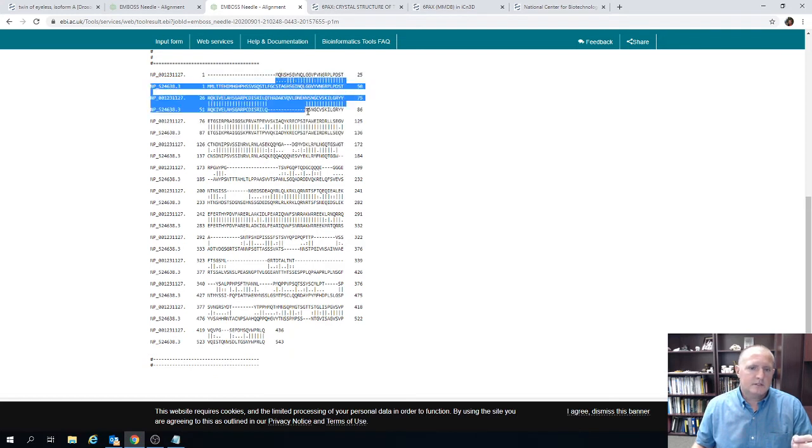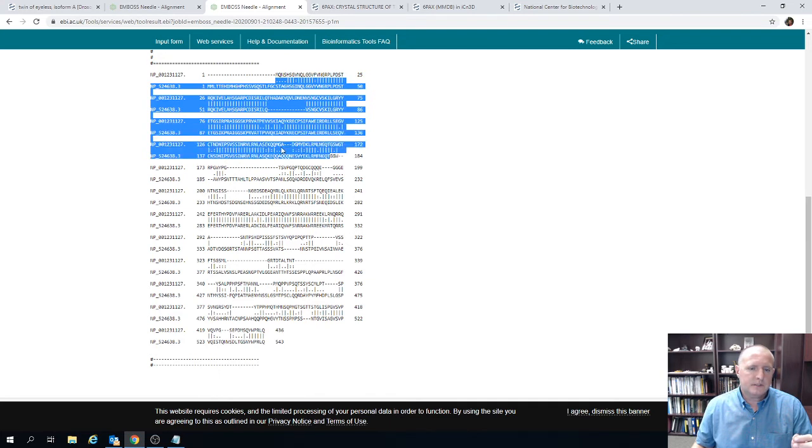And you can see it's actually highly conserved with the fly, so it's one of the conserved regions with the fly homolog, and that kind of explains why the mouse version of the protein can actually function similarly to the fly version and can replace it and start that eye differentiation cascade.